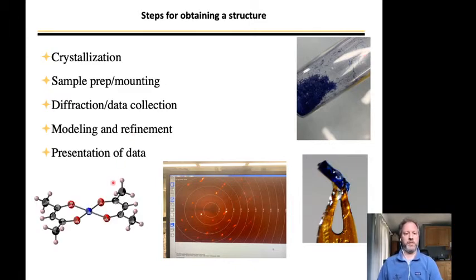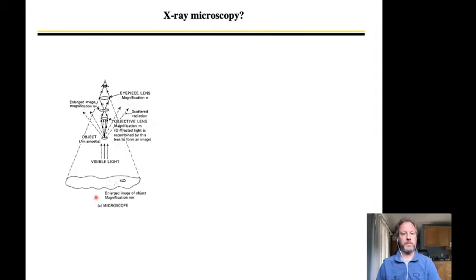And then finally, present the data. So this is copper with the 2 ACAC ligands, and we can see that that's what our structure looks like. And so what I'm going to want you to understand is, what do these balls mean? What are these? Why are these different colors, different shapes? What am I looking at? So that's what I want you to get out of this.